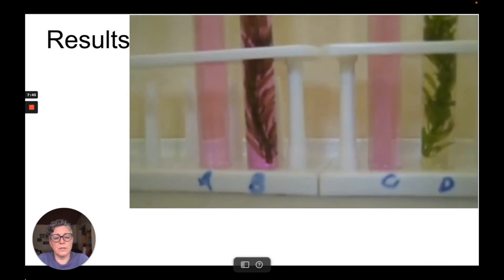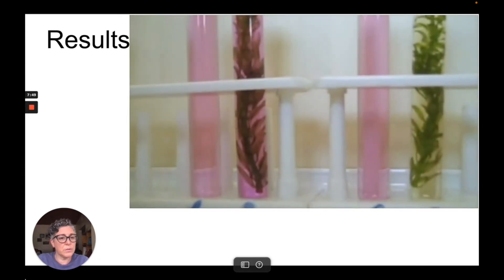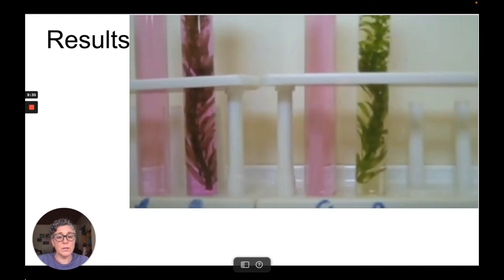Here are the results. The two tubes on the left were in the light. The two tubes on the right were in the dark. We see that tubes A and C had no change. B which was in the light had a darker pink color to the hydrogen carbonate indicator and D which was in the dark, the hydrogen carbonate indicator turned yellow.